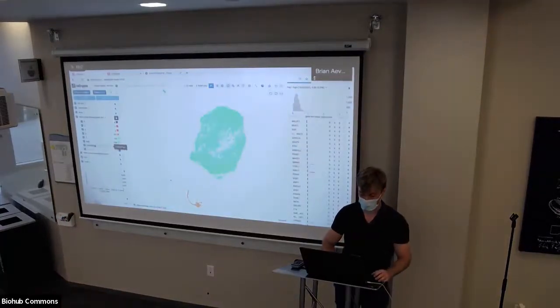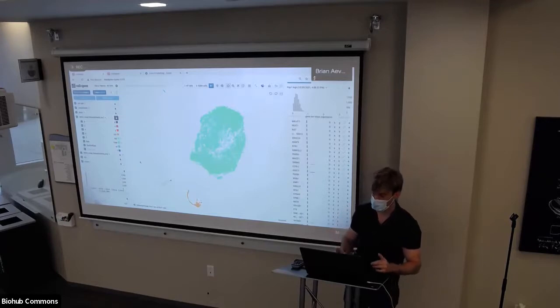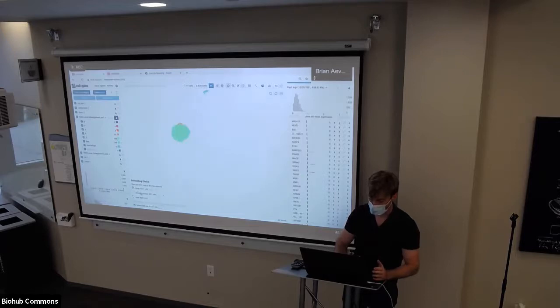And cool. And so now the beautiful part about CZ Biohub, this is functionality that was already there because they had an experimental version of re-embedding. If you've generated something in a subview, you can go to the parent view and you can see exactly where these cell types are. So that cool cell type, it's up there in some other part of the manifold.